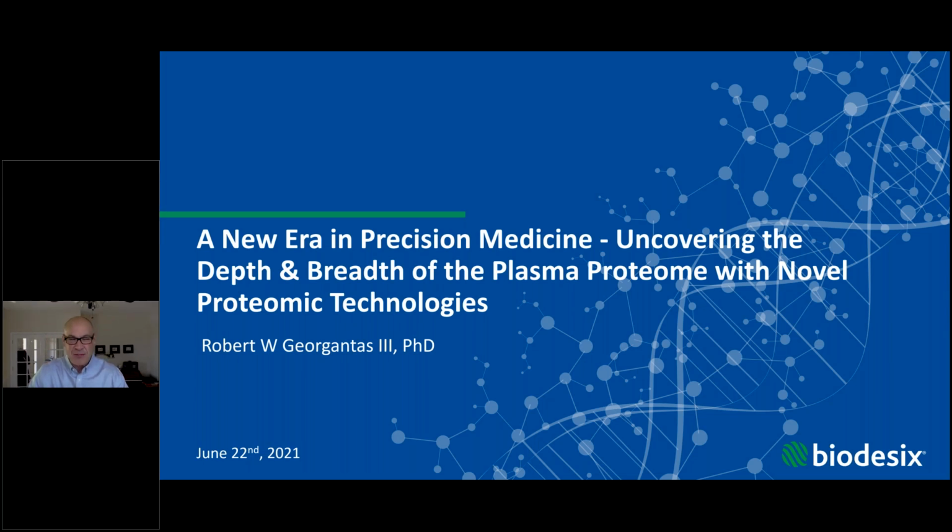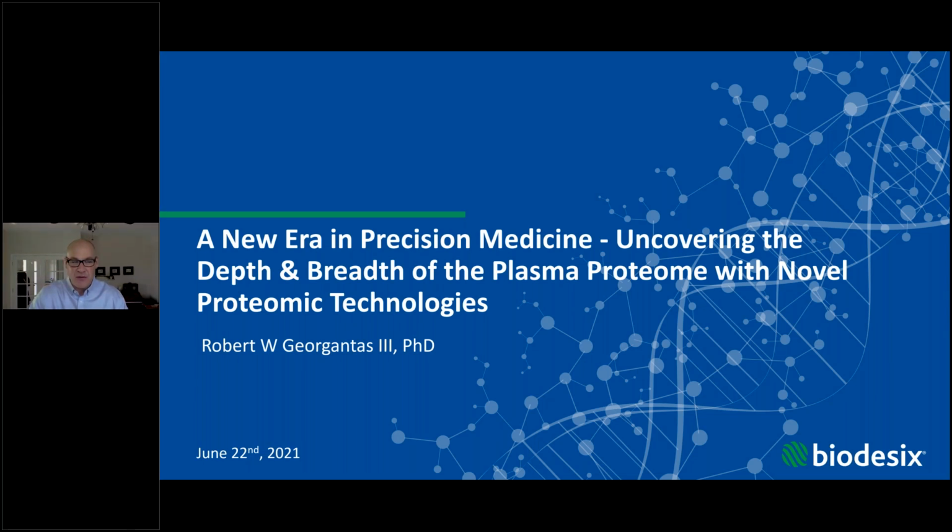Thanks for the introduction, as well as to Daniel for the great overview of the Seer technology. Today, I'll be taking everyone through the novel proteomic technologies that we're using at Biodesix for biologic translational science, as well as for biomarker discovery, with a particular focus on how we're integrating the Seer Proteograph technology into our current workflows and discovery platform.